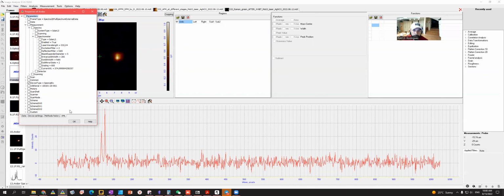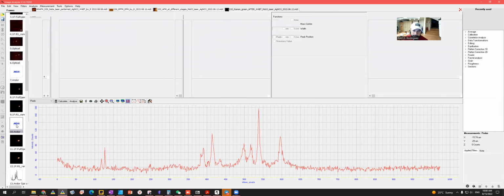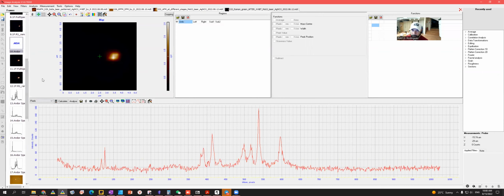Okay, so this was filter 2, and I guess that this one was filter 1.5, higher intensity. Not so good. I should have started with the highest intensity. What is the difference between these two then? I need to check it out.